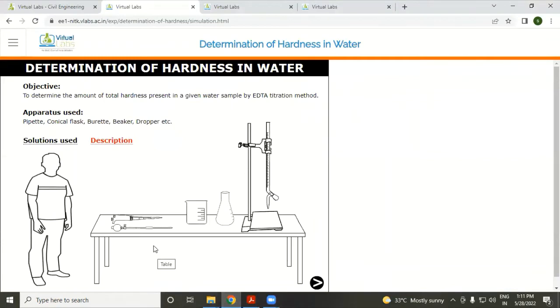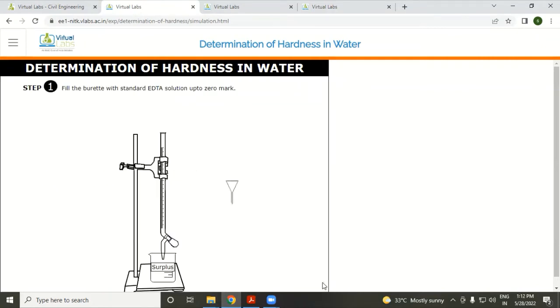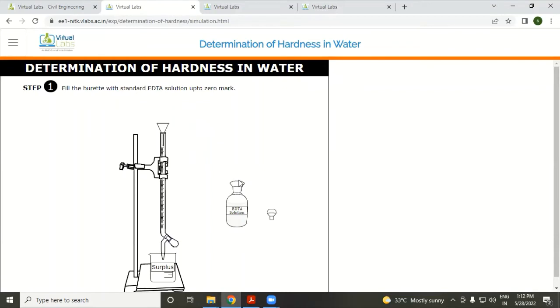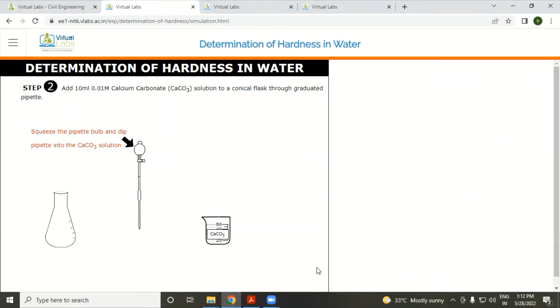For the standardization of the EDTA solution — EDTA means ethylene diamine tetra-acetate acid — fill the burette with standard EDTA solution up to the zero mark. Open the knob of the bottle and fill up to the zero mark. Then add 10 ml of 0.01 M calcium carbonate solution to the conical flask through the pipette.